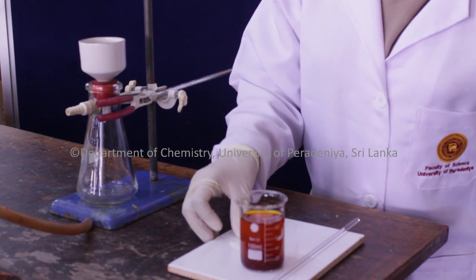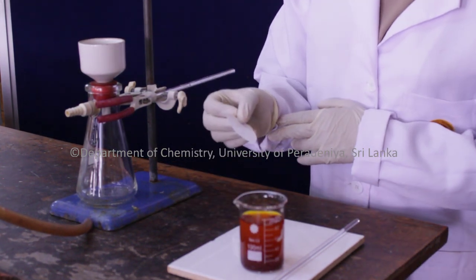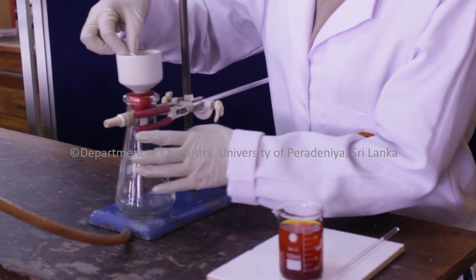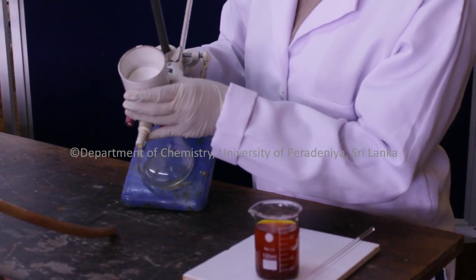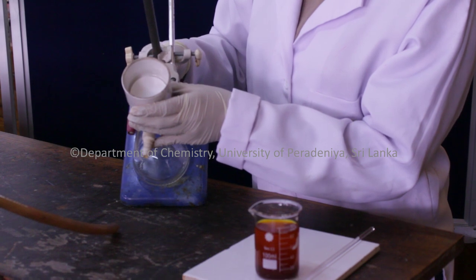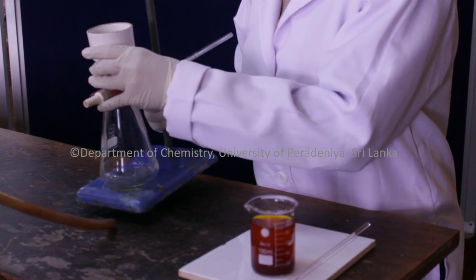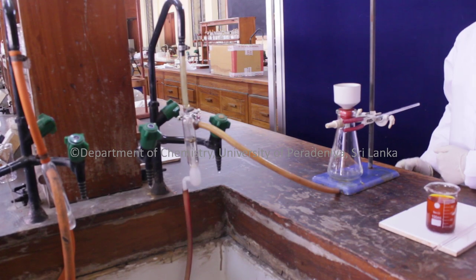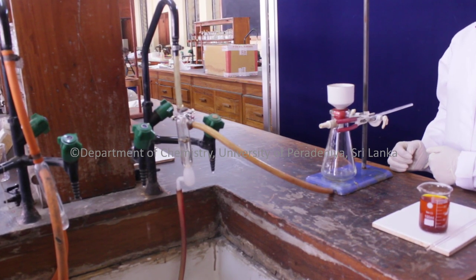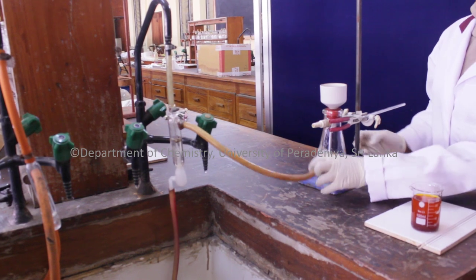After that, we have to keep the relevant size of filter paper on top of the porous plate of the funnel. Then we have to connect the vacuum source to the Buchner setup through a rubber tube.